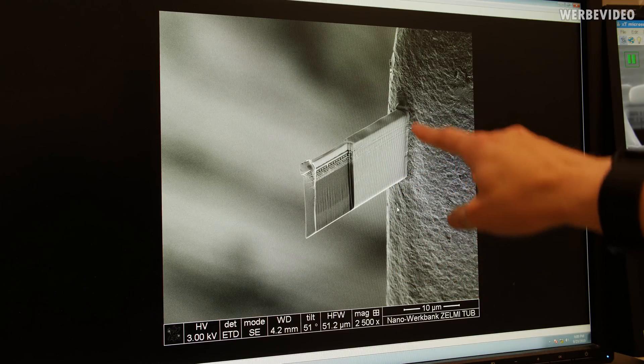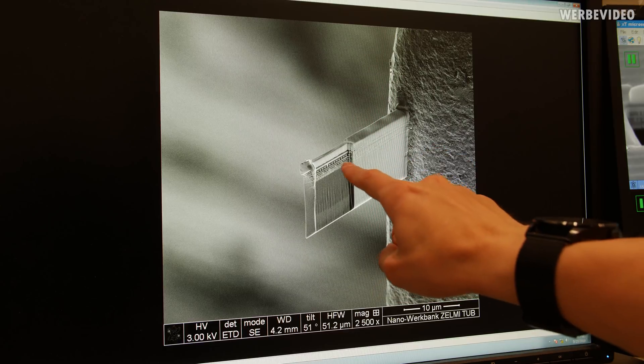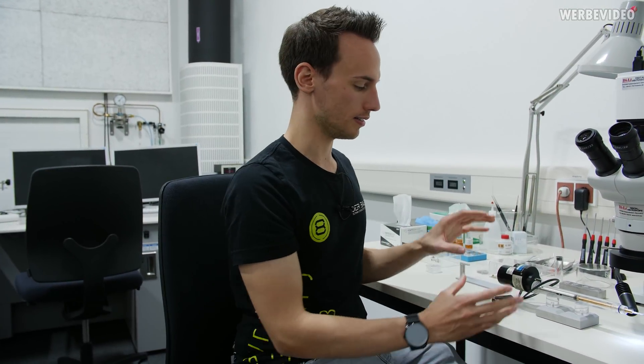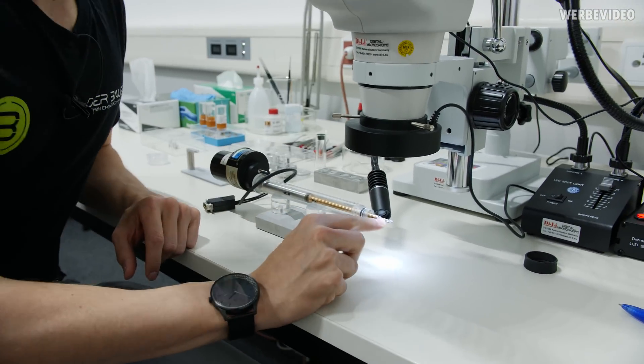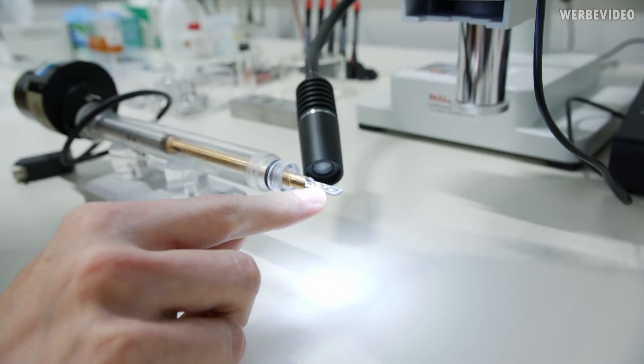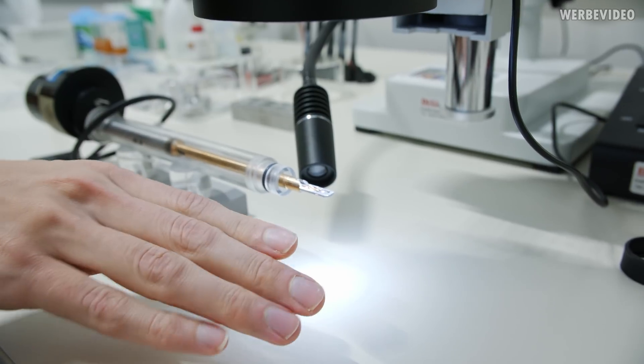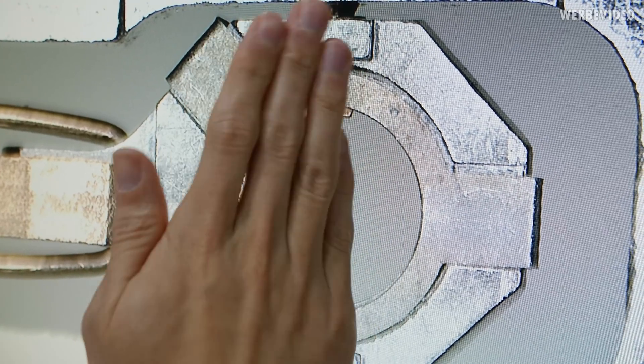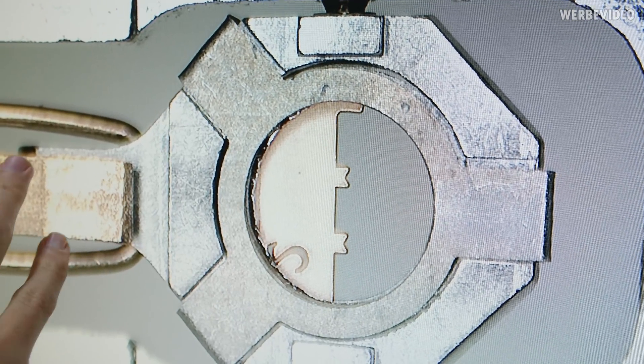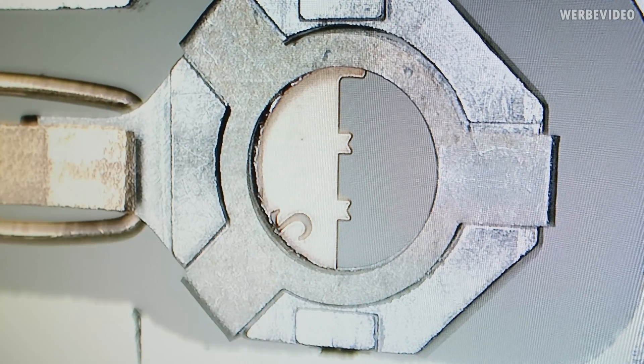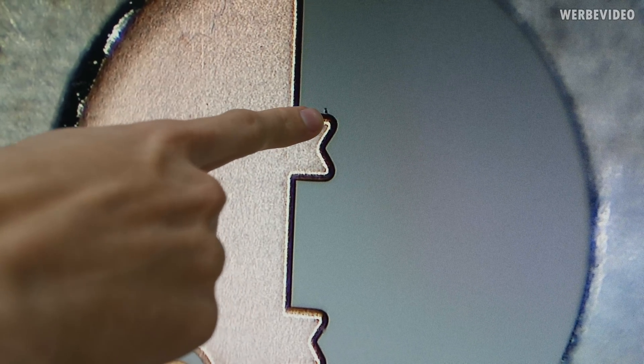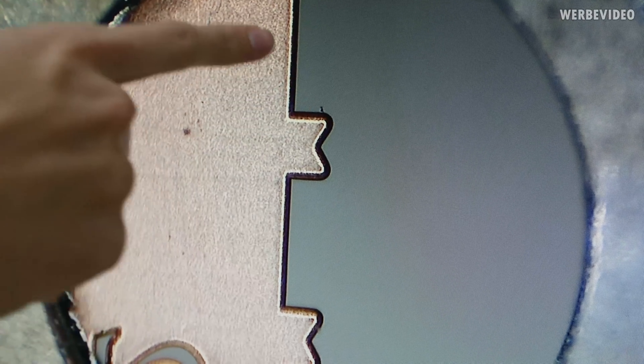In our case, we have the specimen mounted with the platinum on the sample on the side. You can see the structure of the 9900K here and it's thinned out again by the ion beam to make it suitable for the TEM. And that's what we will take a look at now. The lamella is now placed inside the small sample holder, which we have next to me on the table. It's placed right in front here. It's so small that you cannot see it with your eye. There's a small mechanism on the end which allows the sample holder to be moved in those directions. We can see that if we move to the screen over there. This element or the table in the middle can be rotated over this axis, over the mechanism which is sitting on the left. The sample is right here and you cannot really see it. It looks like a small piece of dust. And even now you would think that this is a small spot on your screen, but it's not. This tiny piece, this tiny element, that's the sample which we will look at at the TEM now.